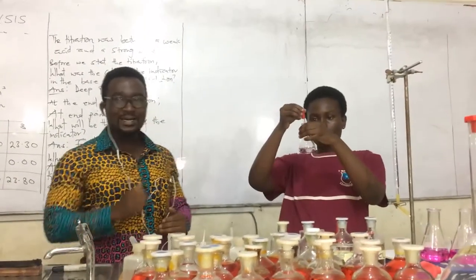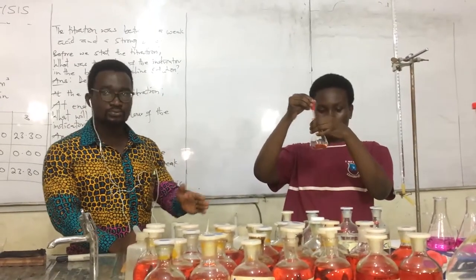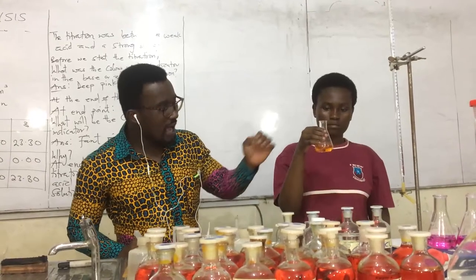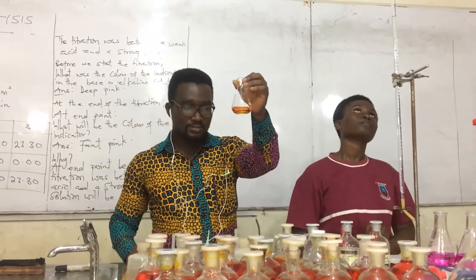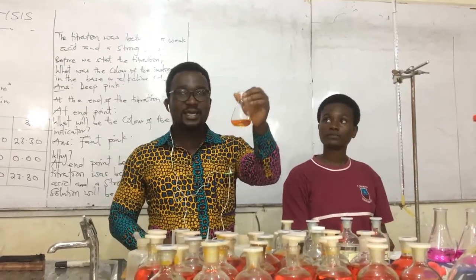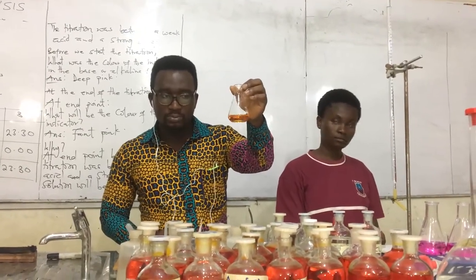Now, we still want to watch our madam. Let's look at the color we will observe: methyl orange in solution B. You can pause the video and guess what color this is. If your guess is that the color in here is yellow, then you are correct. Methyl orange in the basic solution is yellow.